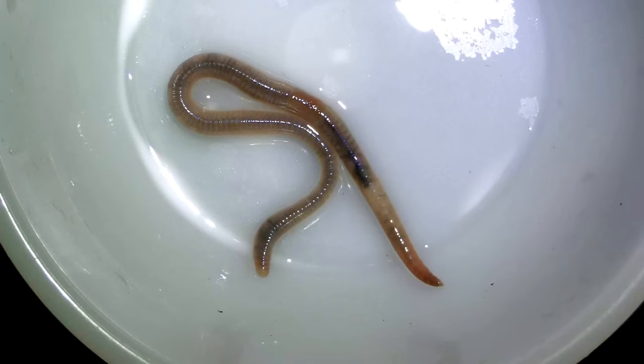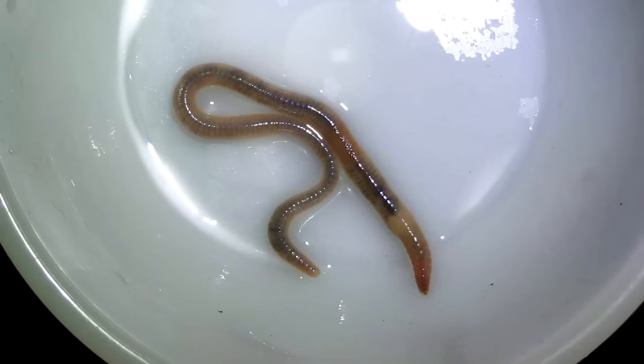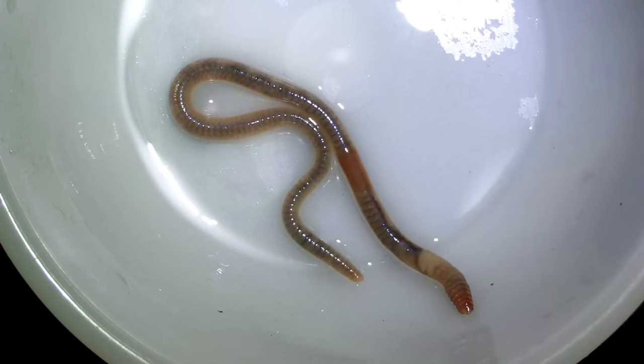Are you here to see a rainworm? Then stick around because you will get the chance to see it under a microscope.